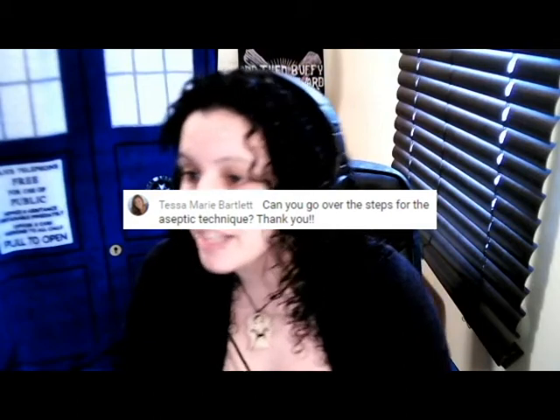So Tessa asked if I could go over the steps for aseptic technique. So I'm going to do that now. Aseptic technique, as it applies to the lab exam, begins with your lab entry exit protocol, which is in the Lab 1 slideshow.